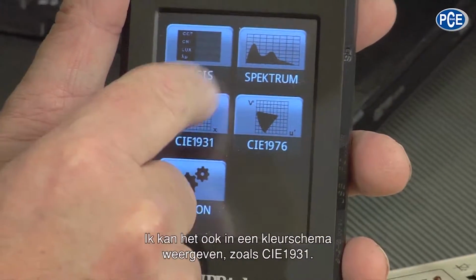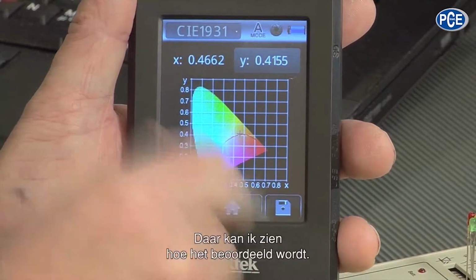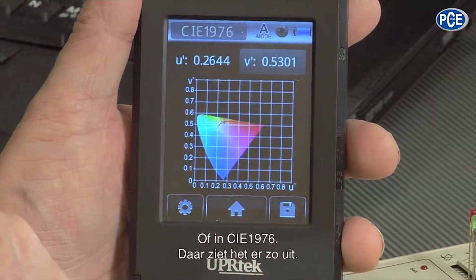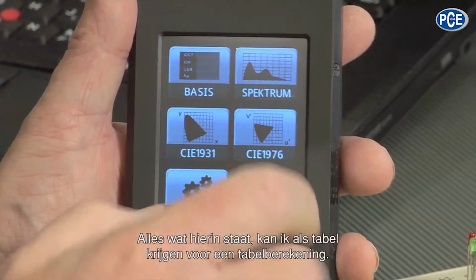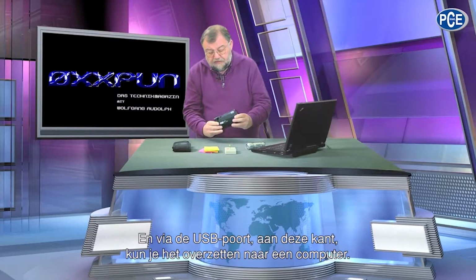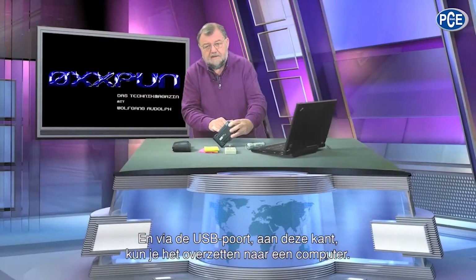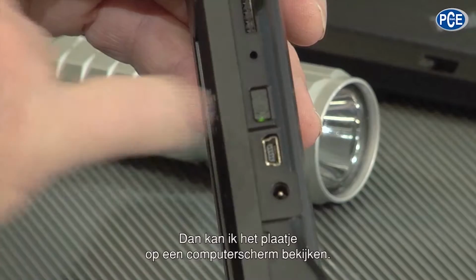I can also let it be shown in color spaces, for example the CIE 1931. There I can see how it is assessed, or after the CIE 1976. It looks like that. All that I have in here, I can have as a table for a table calculation. And over the USB interface, which I have on this side, transfer to the computer, and I can also transfer it as a BMP picture.